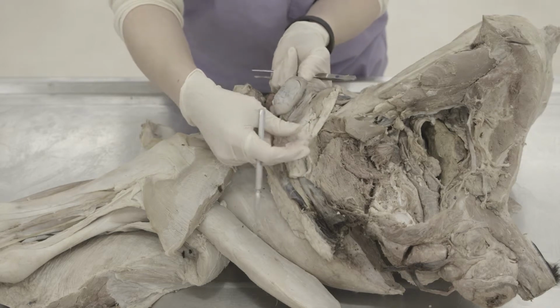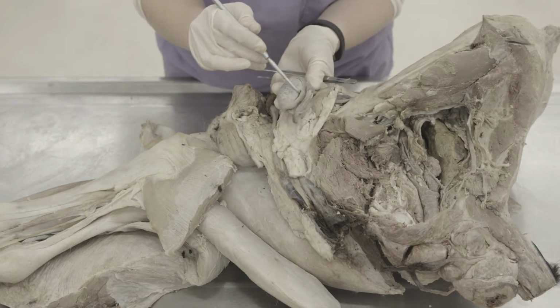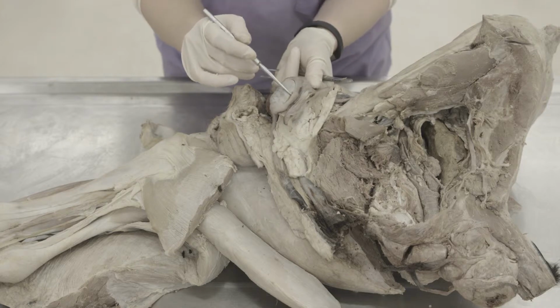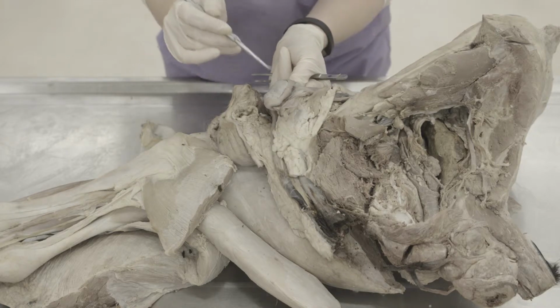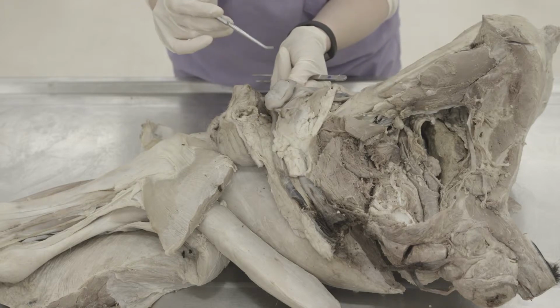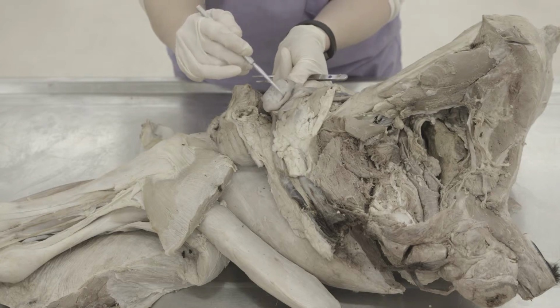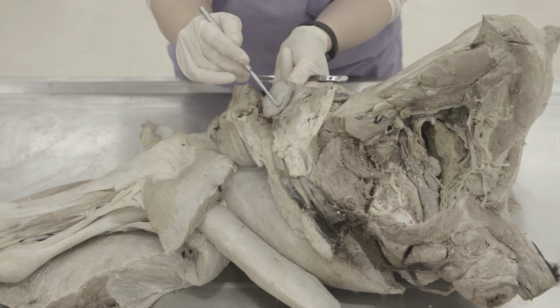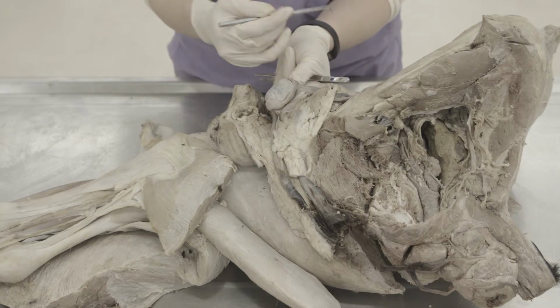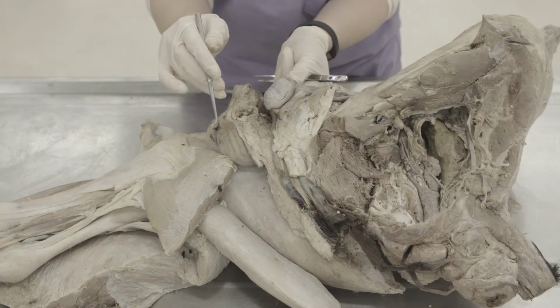Now on the lateral side, you'll have the testicular bursa. So that's where I'm sticking the probe in, and that's always going to be on the lateral side. That, along with the head and tail of the epididymis, should help you differentiate a left from a right testicle, if you have to. On the lateral side, testicular bursa; the head of the epididymis always faces the head of the animal, and the tail of the epididymis is always going toward the tail of the animal.